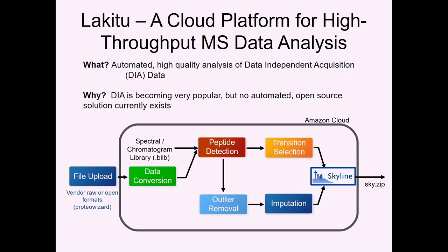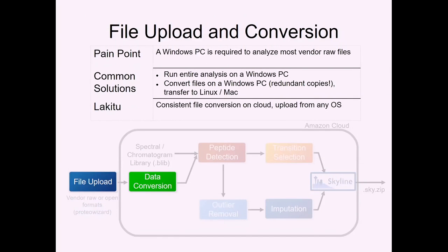So let me start with a couple of these steps and break this down. One of the major pain points that people struggle with is that a Windows PC is still required to analyze most vendor raw files.